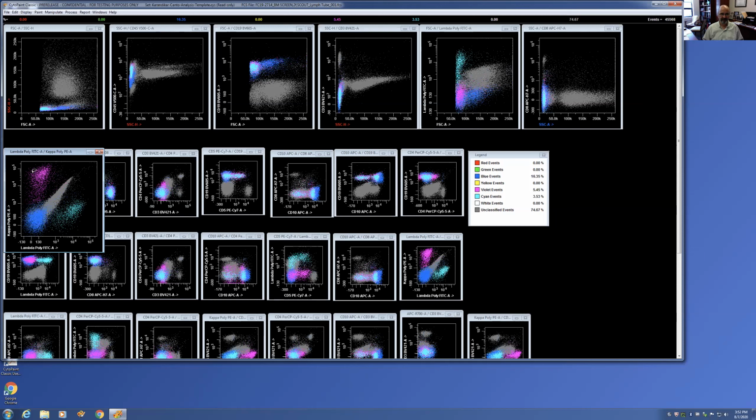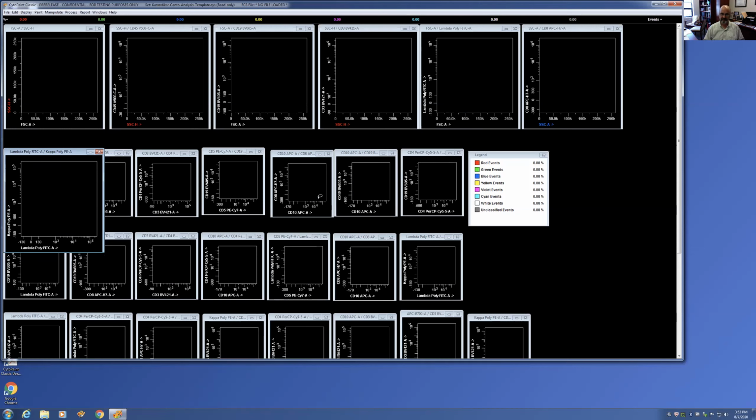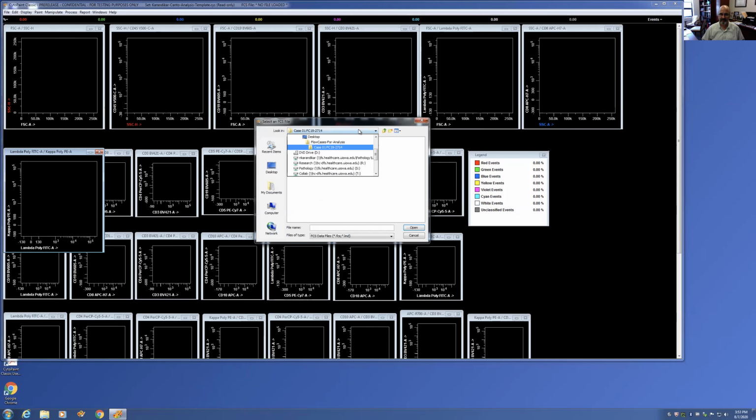16%, even if you don't include the streaming ones, really you should include all of them. So this is a case that has hematogone hyperplasia, and you would go back and see if that made sense. Is this a regenerating marrow? Is this some kind of ITP, autoimmune disease, you know, other causes? So it's a cool case of lots of hematogones. Now let's just do one more case and we'll end this one, and I'll sort of end it as a quiz so that you can then tell me what it is.